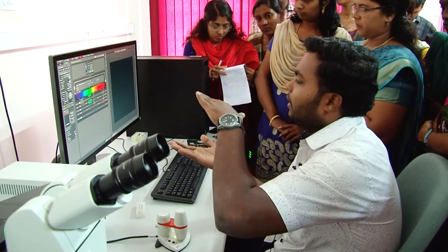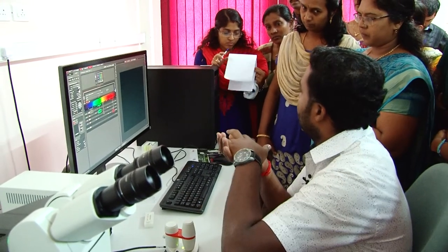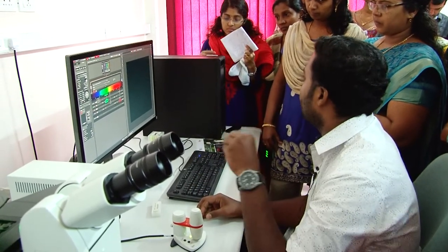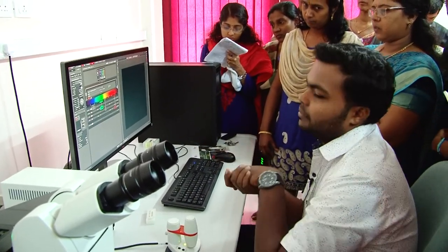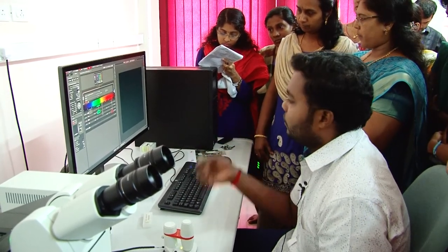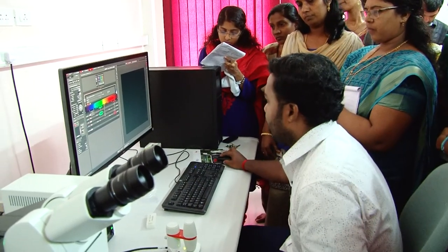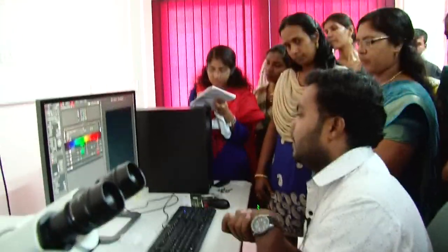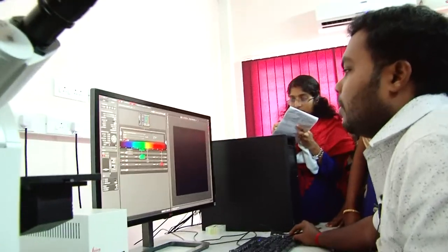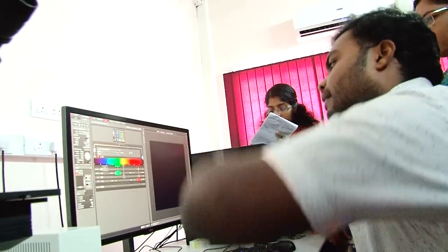So we just set a value for Z for the bottom position and the top position, and then we run the software. We should be aware, because we should do trial and error, that whatever features come up, if the sample is dusty or something like that, it should also be in focus. So we should be very careful and very accurate in doing that. We just focus on the downside. Actually, doing this in this software is very easy: if we know the values, we just find the values for the Z stack for the bottom level and the top level.